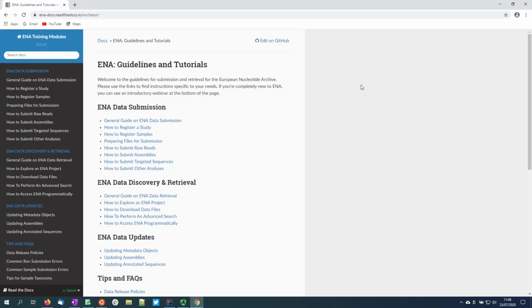Hello and welcome to this short video on how to get started with Webin-CLI in Windows 10. Webin-CLI is a piece of submission software available from ENA that you can use to submit various types of data, including read data, assemblies, metagenomic data, and a few other things.